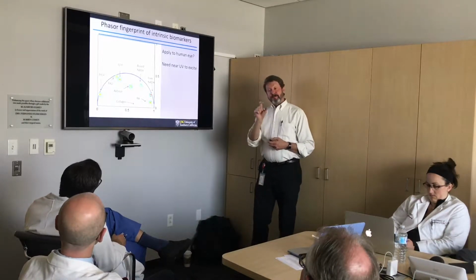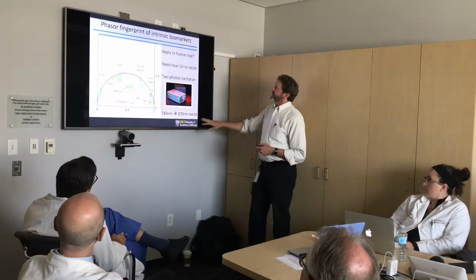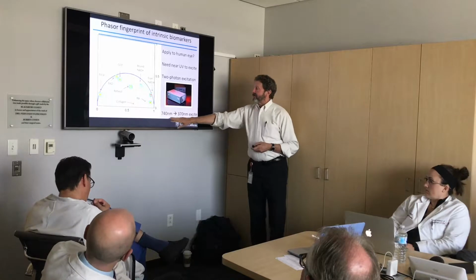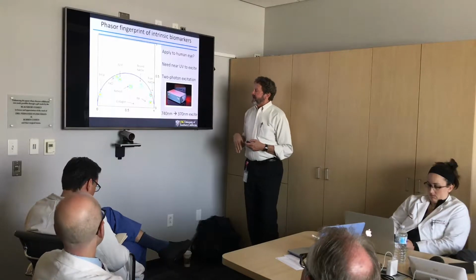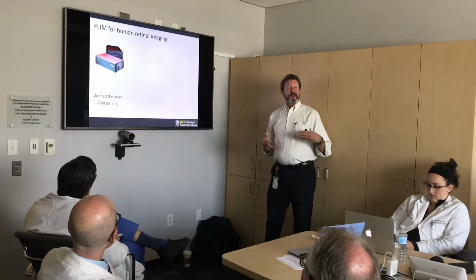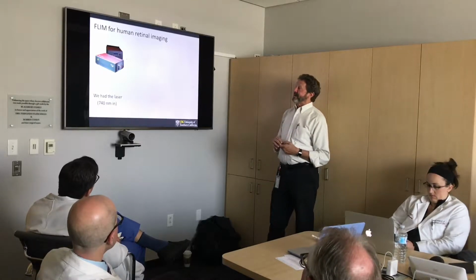That would be a little bit of a problem because, A, it's not that great to blind people with ultraviolet light in their eye, but also the ultraviolet gets absorbed by water. But we're lucky that we can use ultrafast lasers that put out the 80 megahertz pulse, and instead of UV light, we use IR light to excite the dyes. That's IR, so it goes through the vitreous, so it'll go deep in tissue. You can get a nice focus at depth. You might be able to see below the surface and see an ulcer before it's an ulcer, or inflammation that could lead to something.